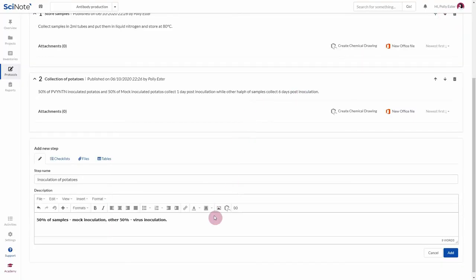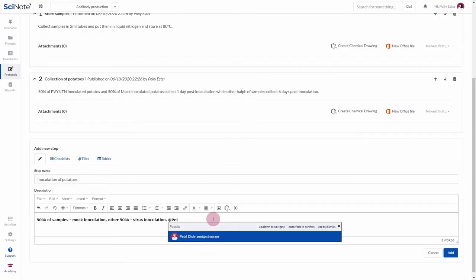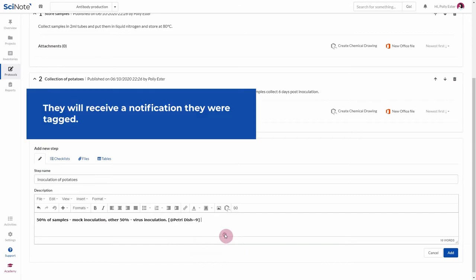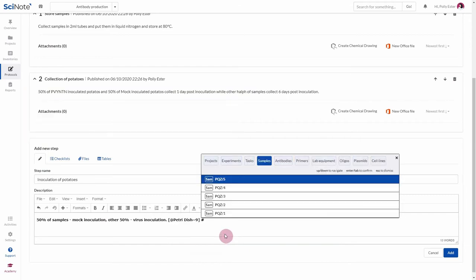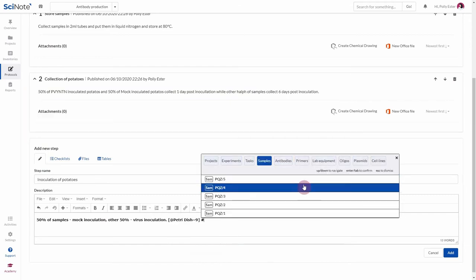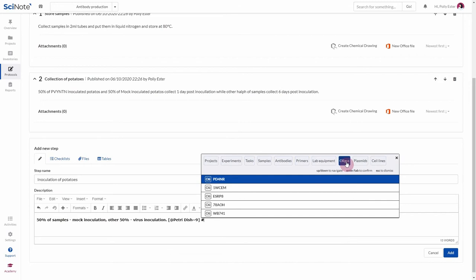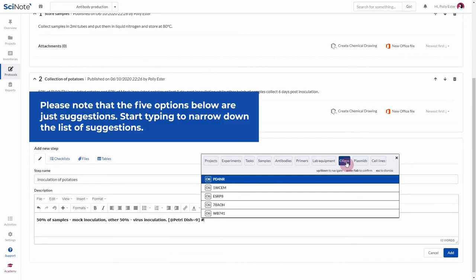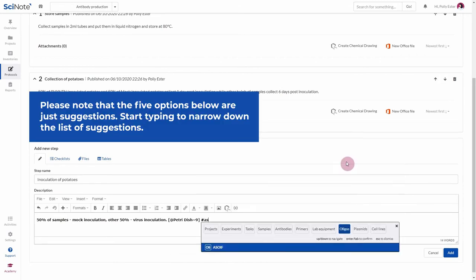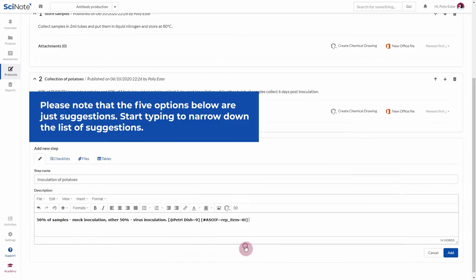In SciNote, you can also use smart annotations for better efficiency. Use the add symbol to tag and notify people. Use the hashtag symbol to connect your data. Tag a project, an experiment, another task or items from inventories.